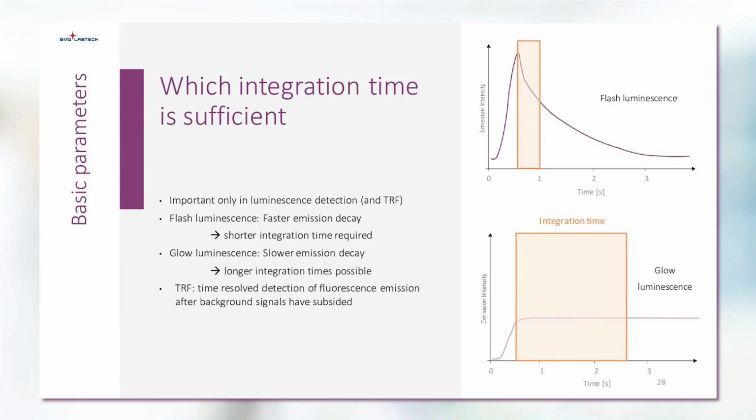In the special case of time-resolved fluorescence applications, I don't show data here, but just to explain it shortly, a fluorescent sample will emit light over a longer period of time. Here, an integration time window is chosen at which the sample still emits light, but any background signal has already subsided.